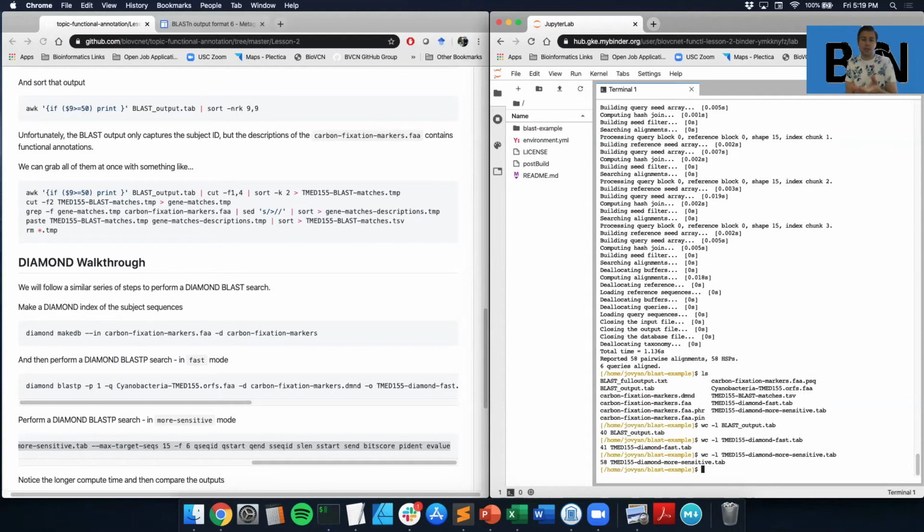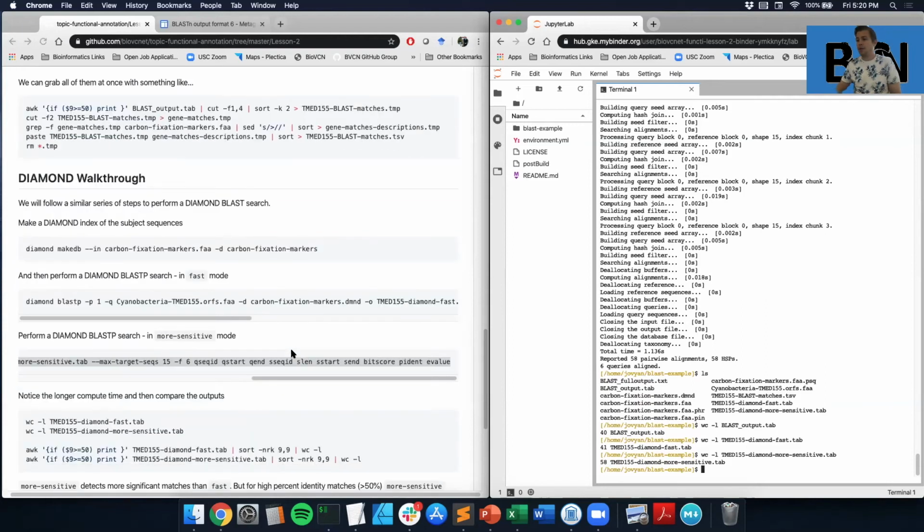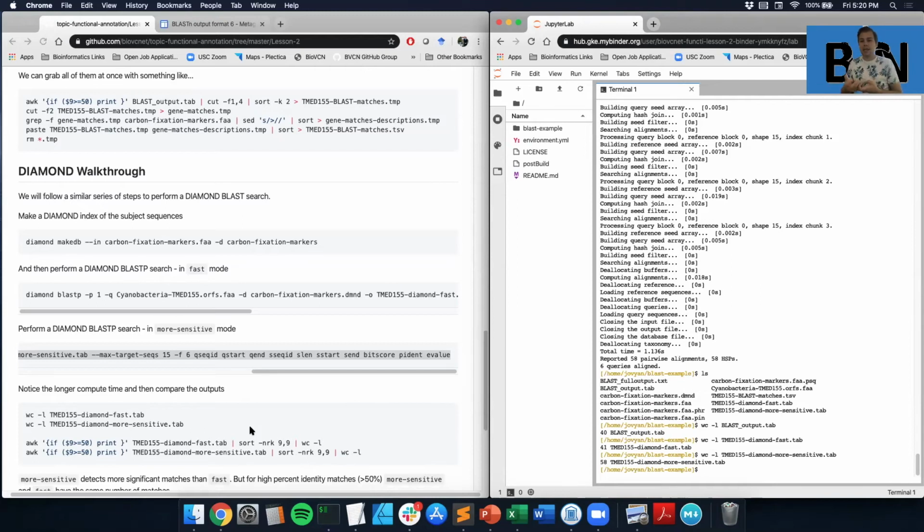And so this goes back, if you watched lesson 2 for functional annotation, we talked about Diamond and how Diamond is similar to BLAST, but it doesn't always return exactly the identical match to BLAST. And so we'll see that that can have an impact on what we're going to see in our output. But that's something to be cognizant of: while it's running in a similar capacity to what BLAST does, doing local alignment searches and giving you an all-mapper return value, the output doesn't actually match up one-to-one in a lot of instances. And that's just because of the way the algorithm runs under the hood compared to the two different versions of the program that we're looking at.